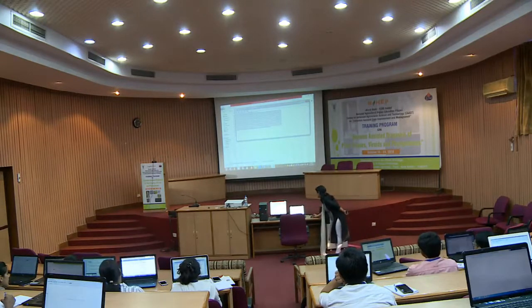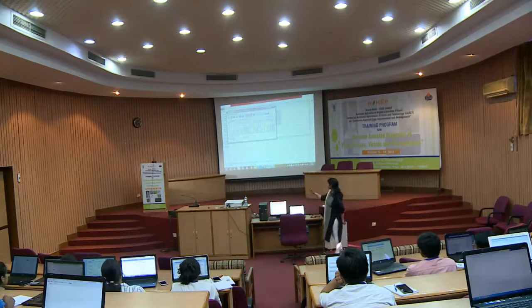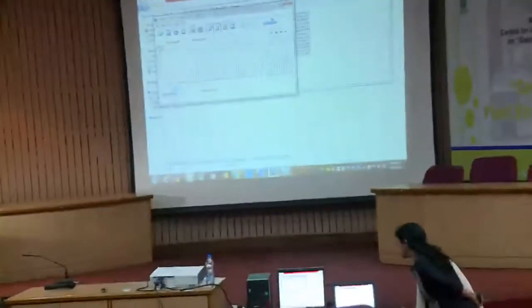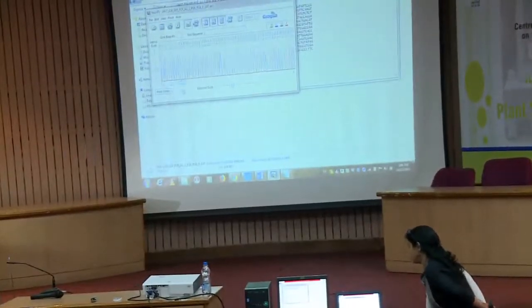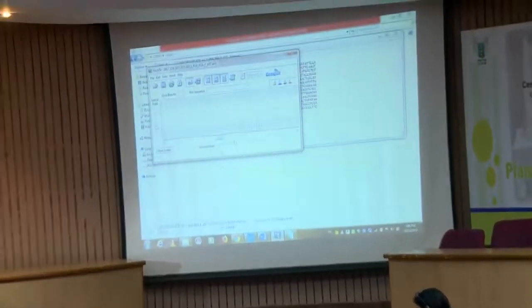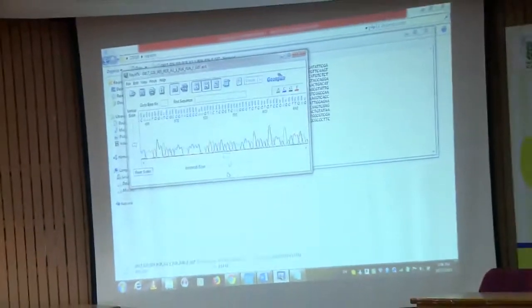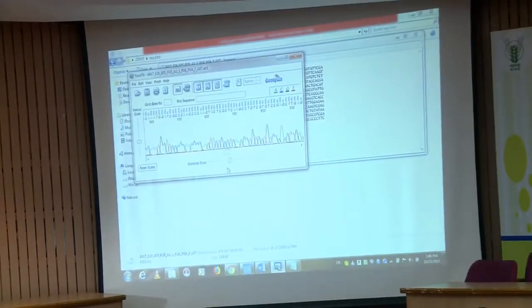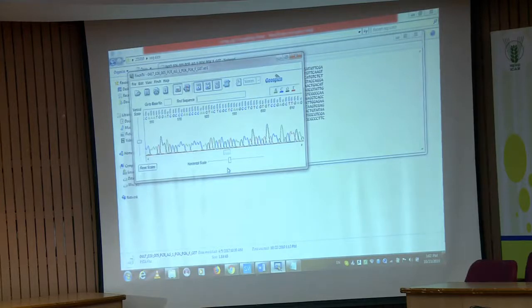So, the Finch TV file which I had just shown you, this is the Finch TV. This is the chromatogram file of each and every base of your sequence, correct. If you just scroll down a little bit, you will get the whole sequence. This is the data which I am showing you, very good data. What will happen with bad data? Either you will not get any peak, or one peak is overlapped by another 2-3 peaks, right, or the peaks are not properly resolved.